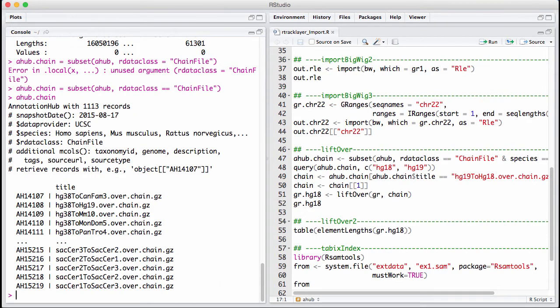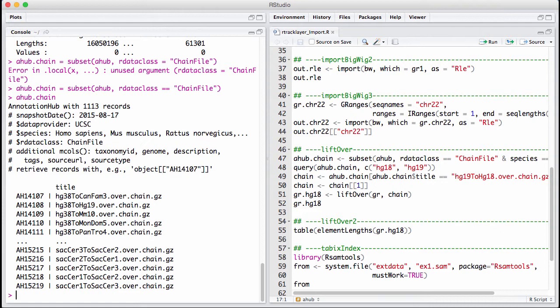In this case, we get chainFiles. We can recognize there's two different genomes. It's genome to genome. There's a mix of human data. In this case, we see yeast data, all the different species that we have in UCSC.